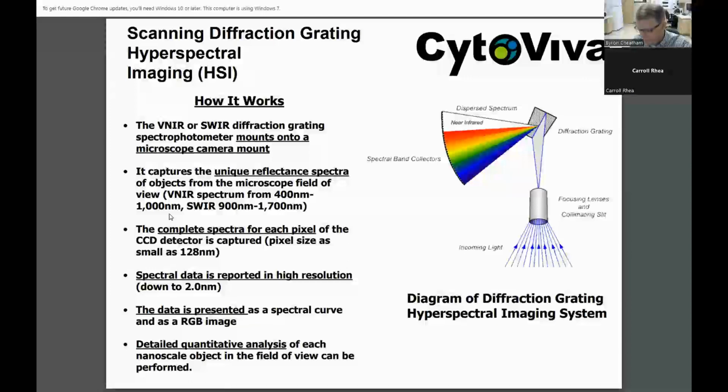But sometimes we work with researchers that may be developing nanoparticles that will get away from tissue autofluorescence, for example. In that case, we can also operate in the shortwave infrared range. We can collect that spectrum from 900 to 1700 nanometers, for example. So we can suit a wide range of needs. One of the things that we would do if we were working with any nano group is to understand their samples, understand which ones would work better in which wavelengths, and make those kinds of recommendations.